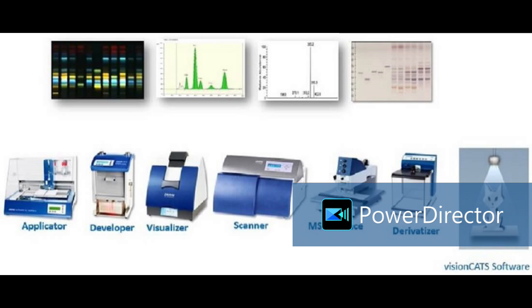This is the TLC-MS interface for hyphenation. Mostly in visceral samples or narcotic samples, unknown compounds are there. We want to find out about the separated band, we have taken its spectra, but after that we want to find out the molecular mass of that compound. So we can hyphenate HPTLC with MS by using this TLC-MS interface. After separation, we keep the plate on the interface. The interface will focus on a particular band of interest, and by using suitable solvent flow, it will suck the band and inject it into a suitable detector, mostly MS. It will show you the molecular mass of the separated component.